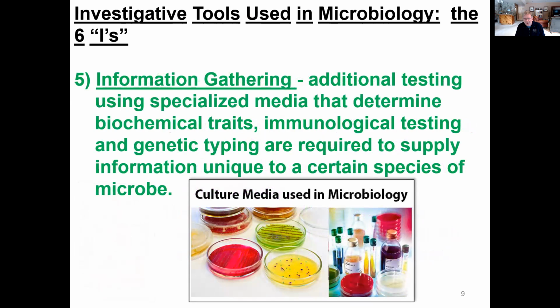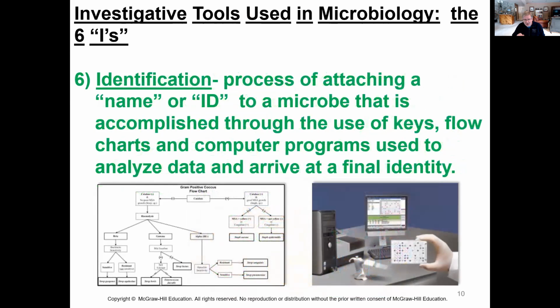I mentioned earlier that one other project that you'll be doing in lab this semester is doing a report of the unknown, right? I'll be giving you an unknown bacteria. You'll be looking at it under the microscope. You'll be staining it. You'll be subjecting it to a bunch of different tests. We'll inoculate that unknown into a wide variety of media, some broths, some semi-solid agars, and so forth. And the idea is then to come up with an identity of that bacteria. So we're going to be gathering lots of information. You will be doing that. Then hopefully identifying that unknown.